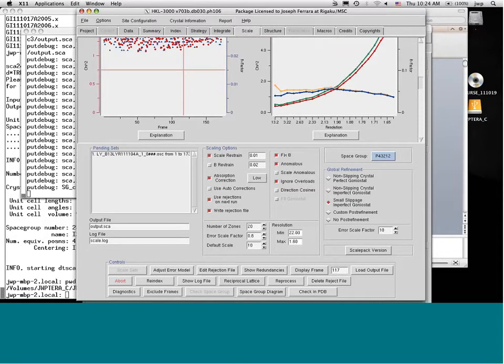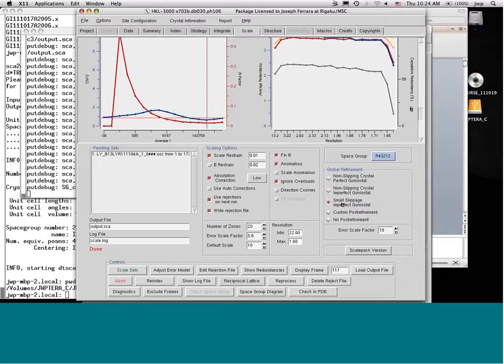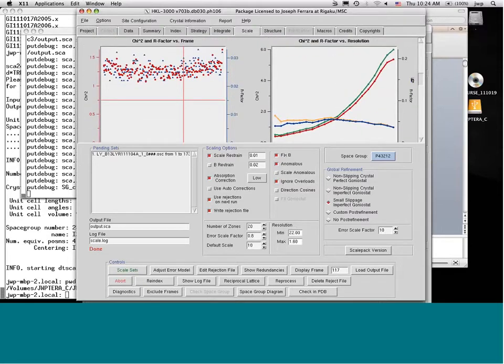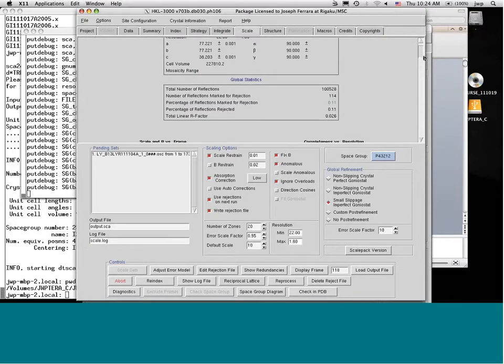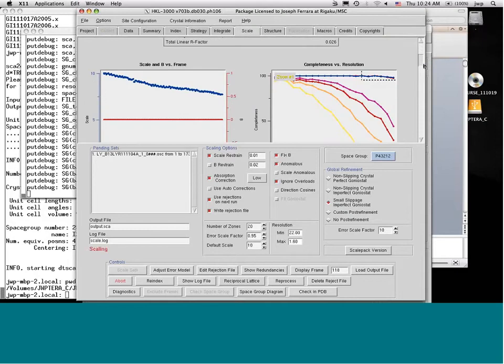So basically, I just made a hypothesis that if I make this 0.8, this will be closer to 1. So I went the wrong way, and I will change this to 0.95 and run it again. And I think I'm already playing around with this too much for this seminar. I think we'll be fine with this.